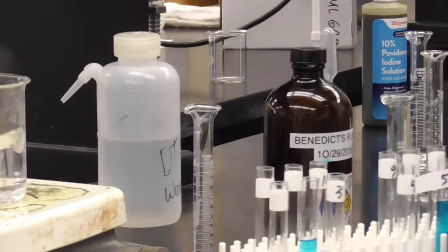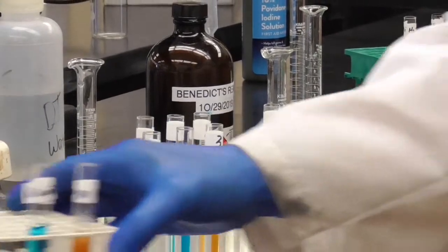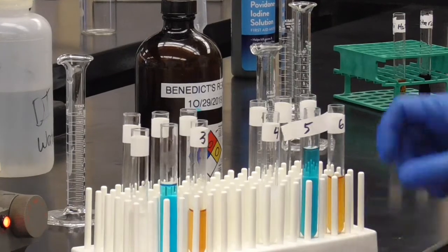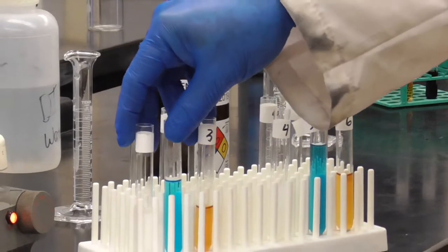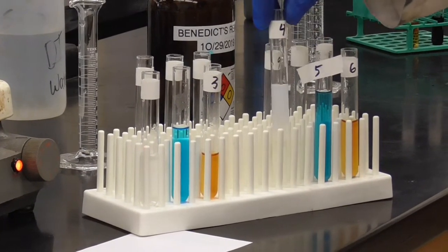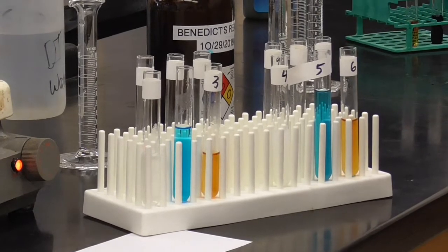And there we go. Our result is, again, remember this over here. This was the negative. This is the positive for glucose. So I think it's quite clear that we are negative. So just as we can recap here, initially it was negative on all 3. After 15 minutes, positive for the chloride, but negative for glucose and negative for starch.